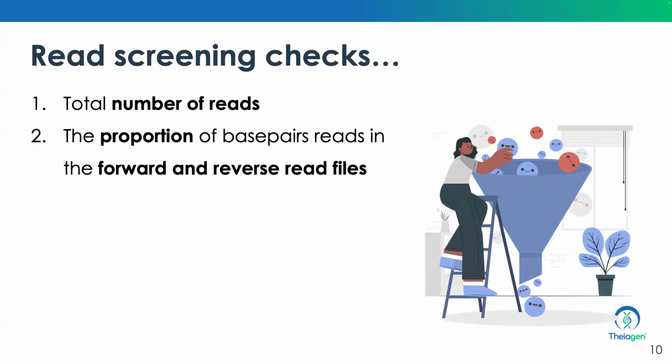We expect that any sample should be able to at least assemble the whole genome length of that smallest known bacterial sample. Therefore, if your pathogen is not even able to assemble that, then there's no point in proceeding, because most likely it won't assemble anything else. At that point, the workflow stops and conserves the resources.